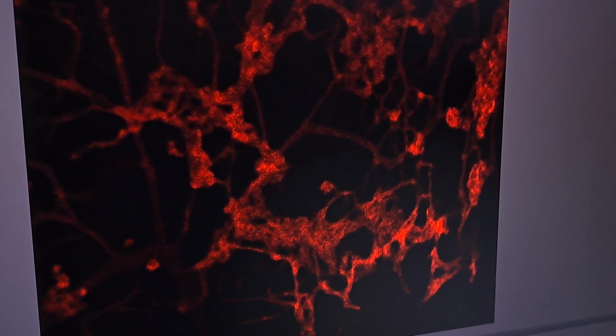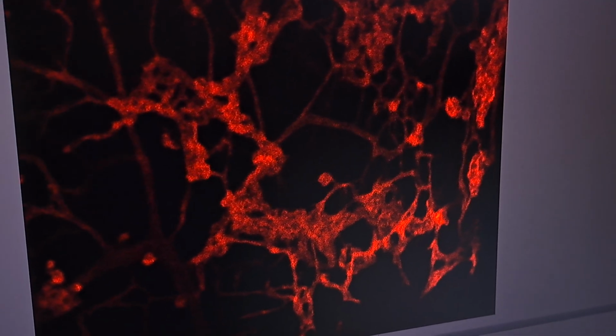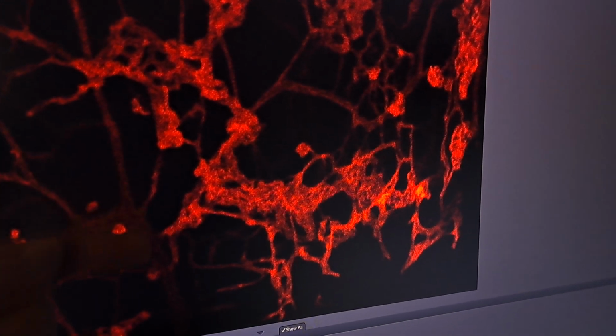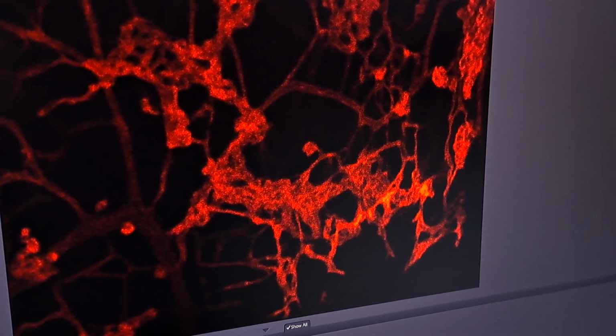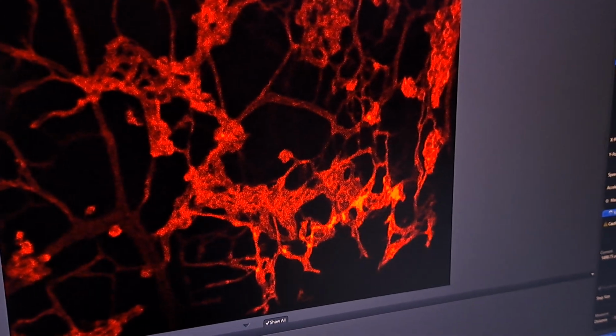You can hear the laser maybe scanning on the microphone here. Scan starts now, and it gets down to about here. That's a scan. So we're going to do 68 of those. Each one's a micron focus deeper.